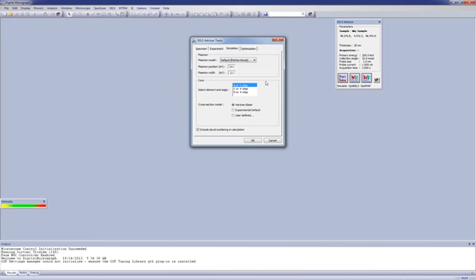The core edges that are shown here, in this case, the sample is boron nitride with some carbon. So we have the boron K edge, carbon K edge, and nitrogen K edge as the edges here. It's possible to choose the cross-section model for each of those edges. The software comes up with a set of defaults. For K edges, it uses the Hartree-Slater model. But we also have a database of experimental defaults that can be used.